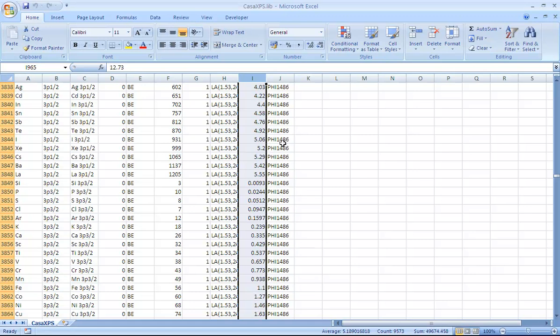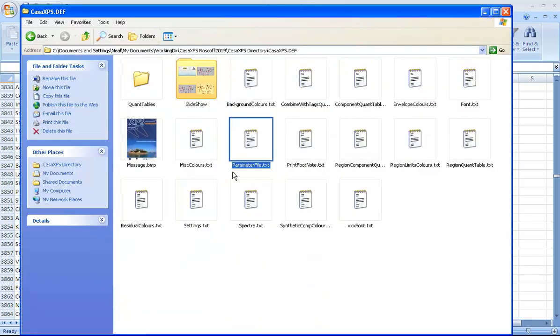This is relating to the photon energy, but this indicates that these RSFs can be tabulated as distinct from the aluminium magnesium Scofield library, and these will be offered for any data for which the VAMAS field within the VAMAS file for the spectrum states PHI 1486 as opposed to aluminium. When a VAMAS file is created by CasaXPS, it's possible to configure the source label that is entered into the VAMAS blocks.